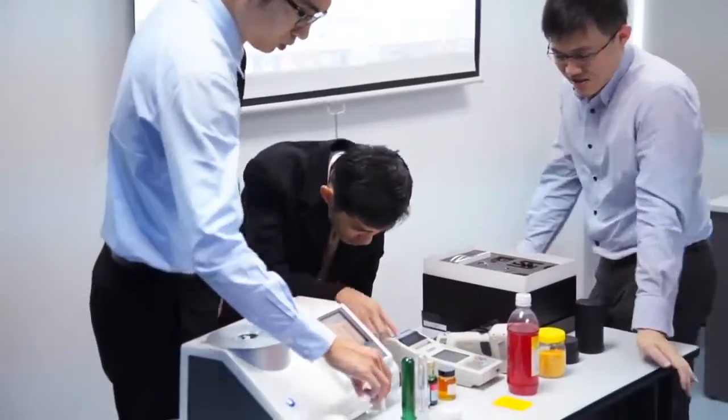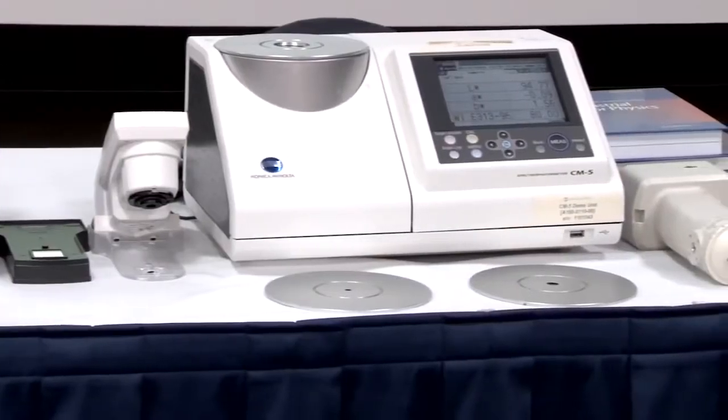Used by top companies all over the world, the CM5 takes the guesswork out of color evaluation.